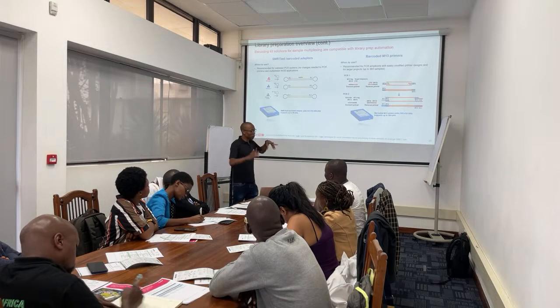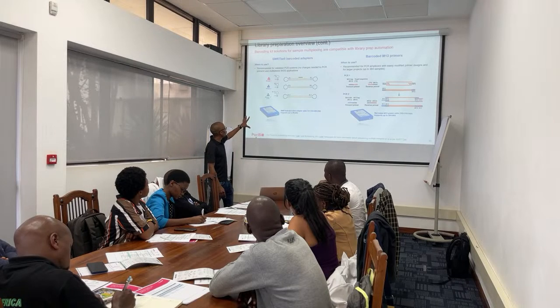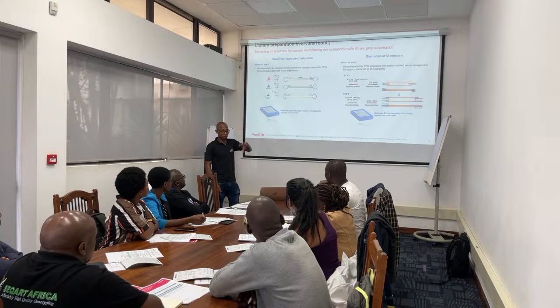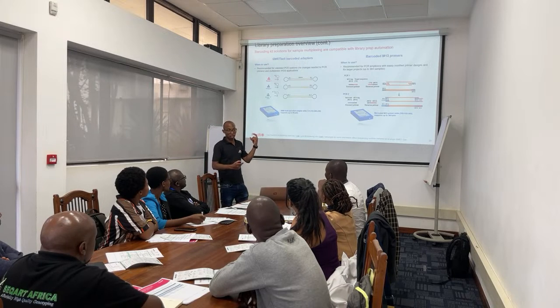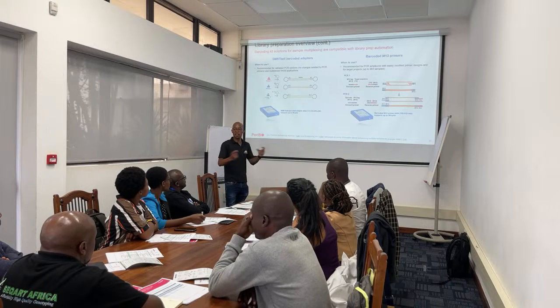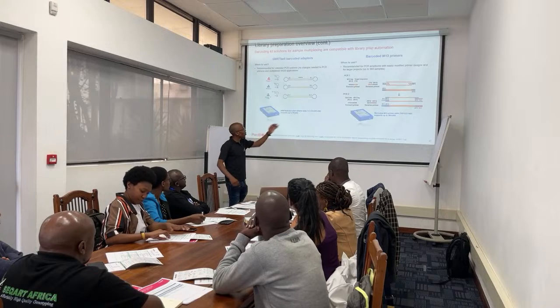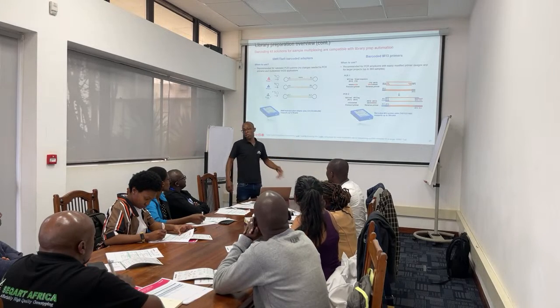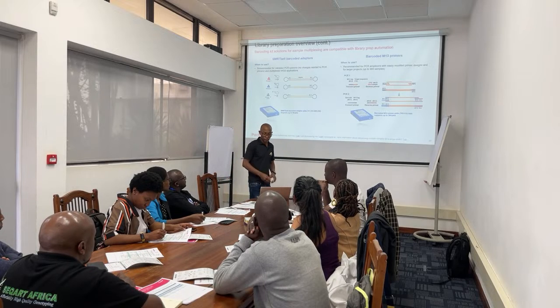Then we have two ways of barcoding. This one is basically used for the SMRTbell adapters. This is what you use for the type of work we're going to do today, where you just ligate, like I showed you before. It's a ligation-based adapter addition. And on my right, this is for your amplicons, your 16S, your ITS, a PCR-based barcoding step.